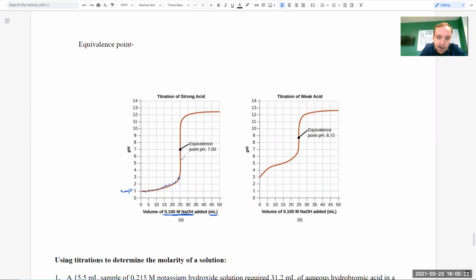And then a very drastic change. With just 1 or 2 drips, you can go from here all the way up to there. So you have to be very careful. Even though you're getting really impatient and you're like, gosh, I wish I could just open up this valve a little bit more and blow through that area, you don't do that, because with 1 or 2 drips, you will go from here all the way to there and you've blown it. You'd have to redo it or go in reverse, which is even more work.